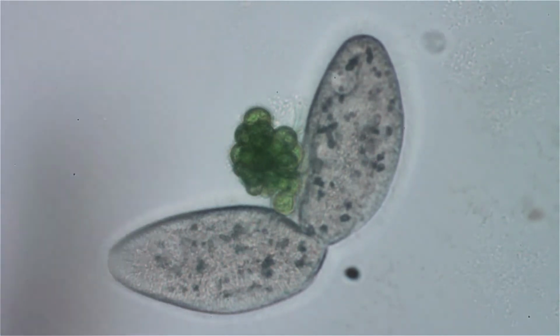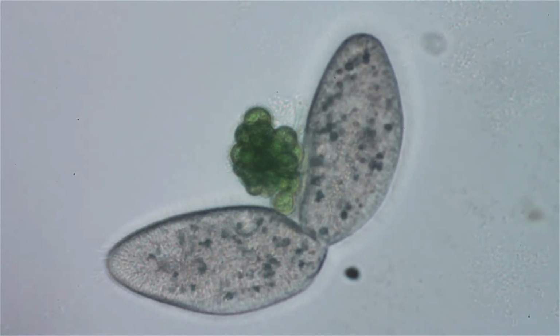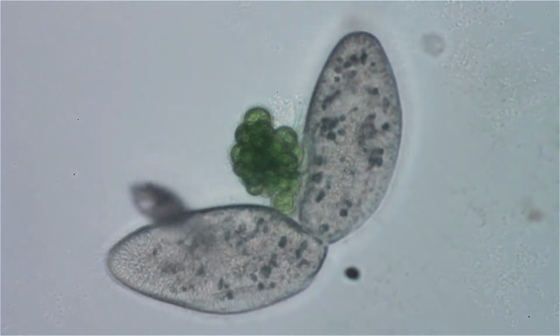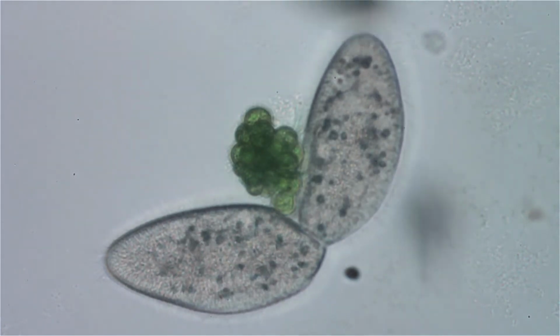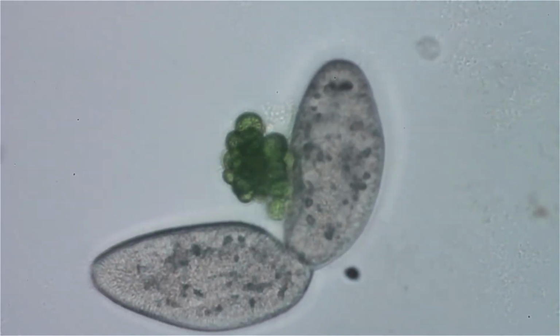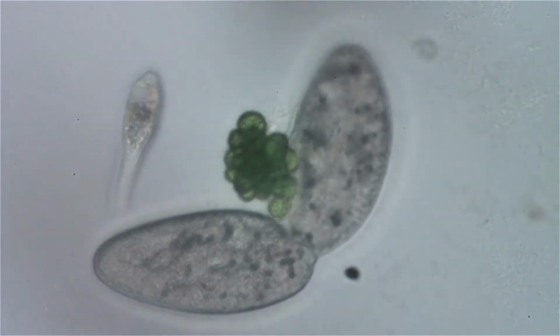And it seems both halves here already have a working mouth. You can see in the middle of each one of them there, more or less working. You can see it. It's on the back side the way he's turned now. They don't quite have an oral groove built yet.